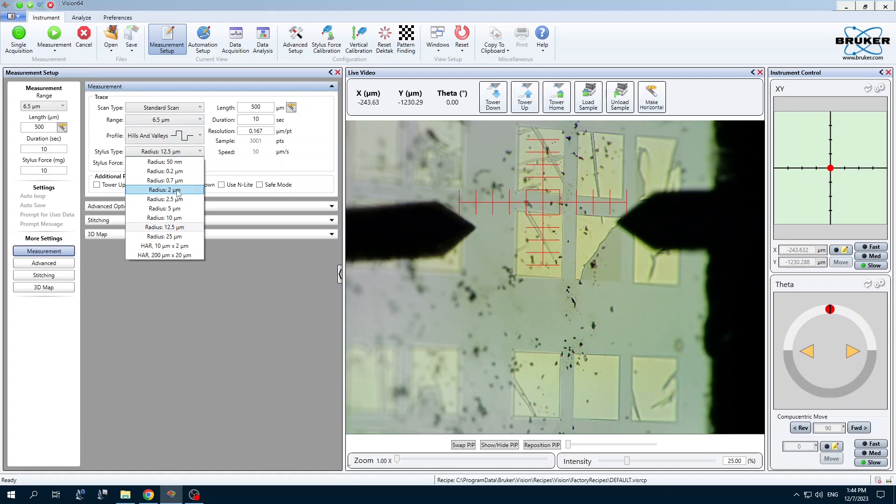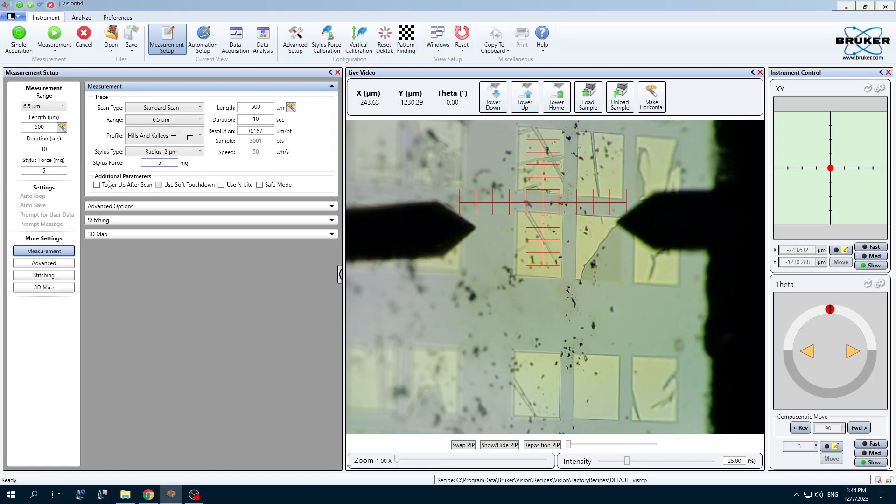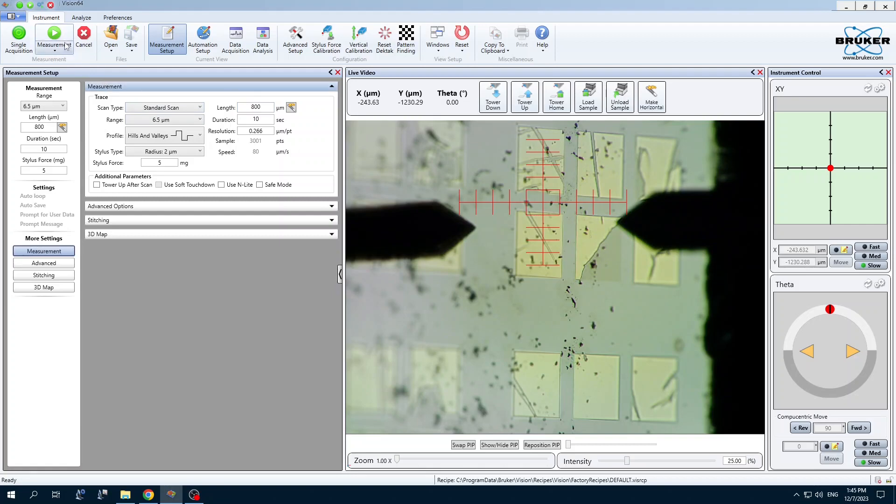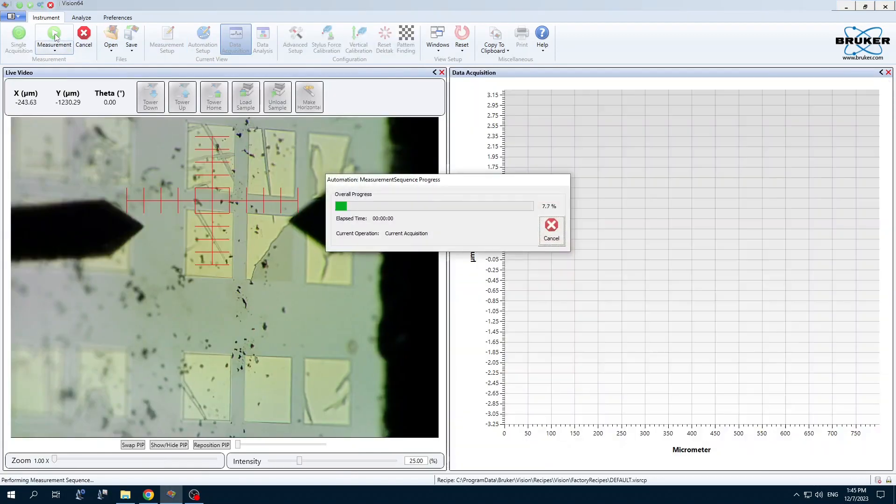We only have a two micrometer radius stylus installed. For stiff samples, five milligrams is plenty of force. Let's say I want to travel 800 microns. Okay, should be good to go. One quick measurement.